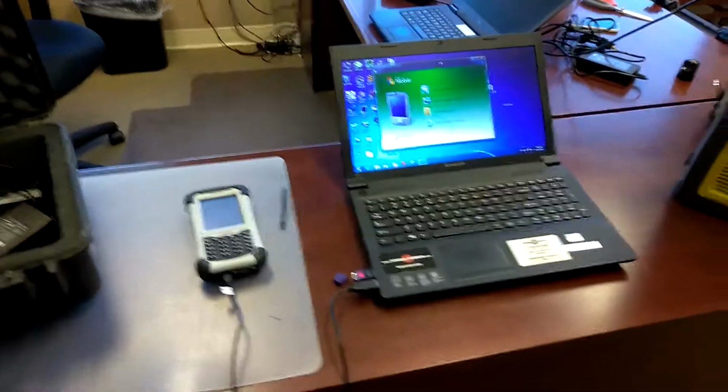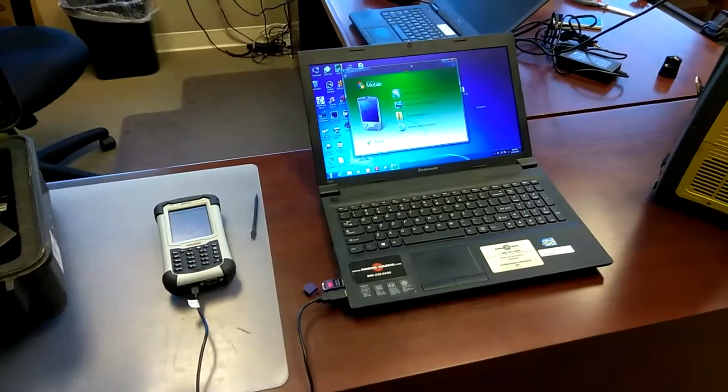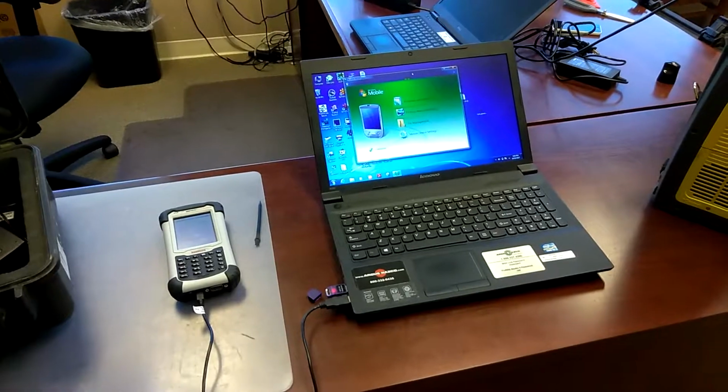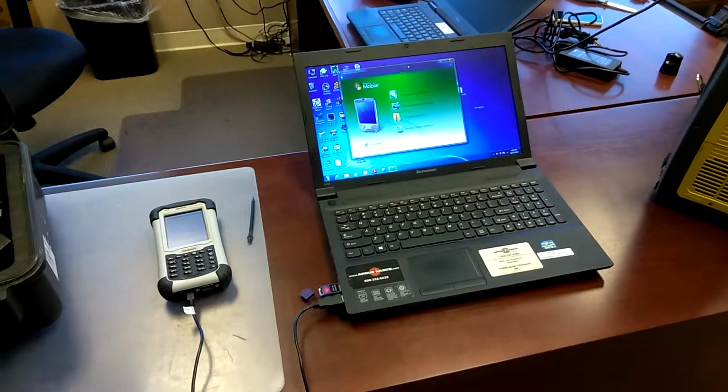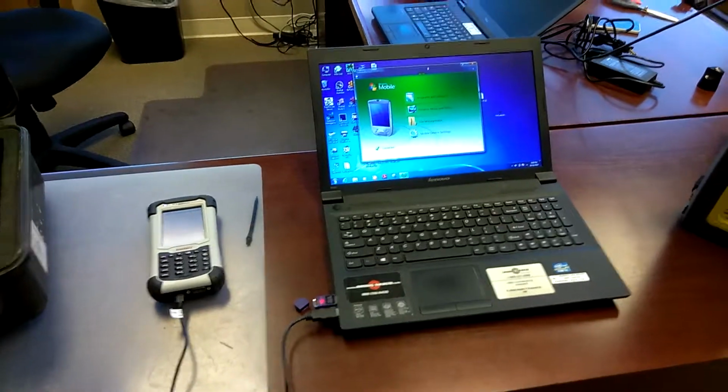Hello everyone, and welcome to the fourth and final part of the Calcmet DX4040 video series. I'm going to show you how to take data from the PDA and get it onto your computer so you can insert it into reports. Or at least as much as I know at this juncture.